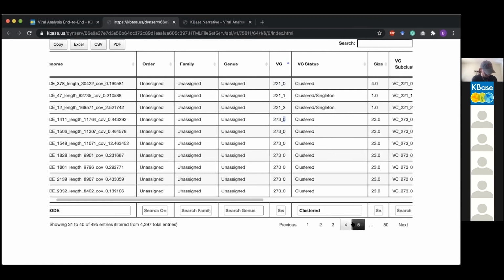And let's go through here. Let's see. Okay, so there's quite a few, and you could go through this all you want. There's other ways of filtering this. As I've said before, anyone who enjoys using Excel, have at it. You could do the same process. If you download this as a CSV, you can process it with just a little bit of Python or Perl or whatever your favorite programming language is. I wanted to find the first one. I think it was on, okay, here we go.